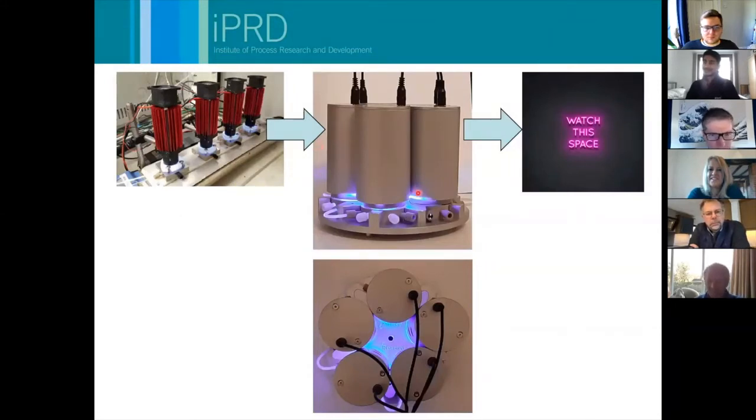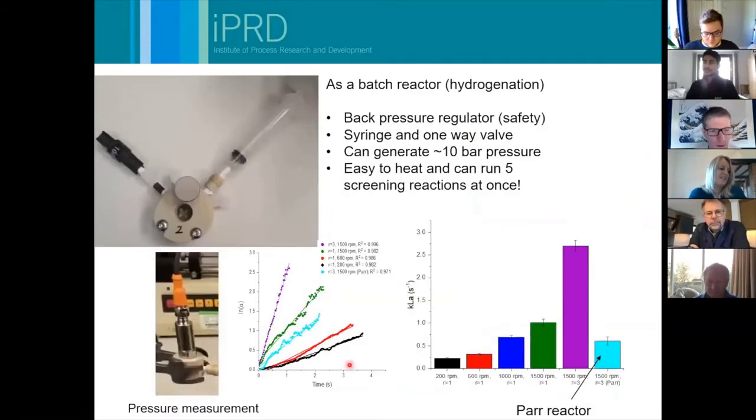So these don't look beautiful yet, but they're performing really well. They've got 365 LEDs in them, and they sit on our standard reactor plates. This idea of modularity, allowing you access to broader chemistries and allowing you to choose what you want to do your chemistries, is a really nice concept that we're developing. I just wanted to show you two other things as well.